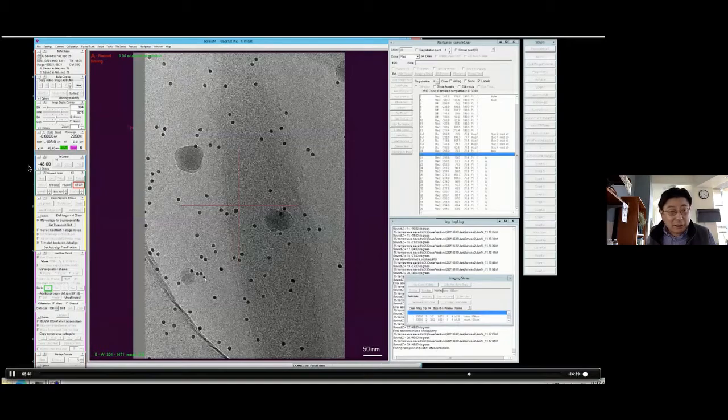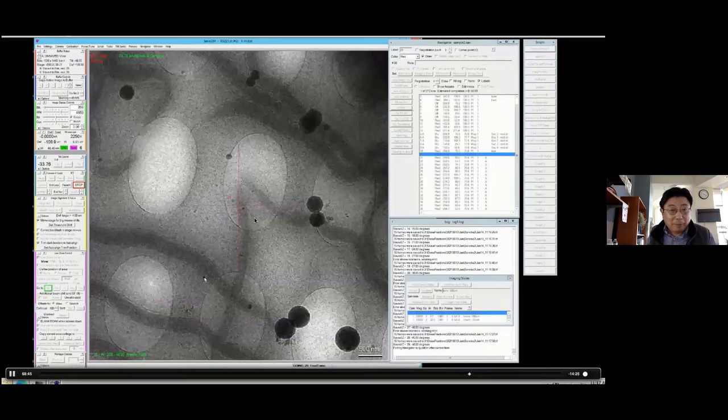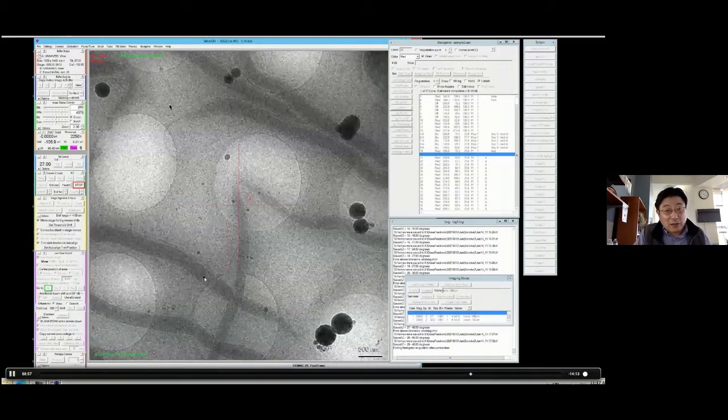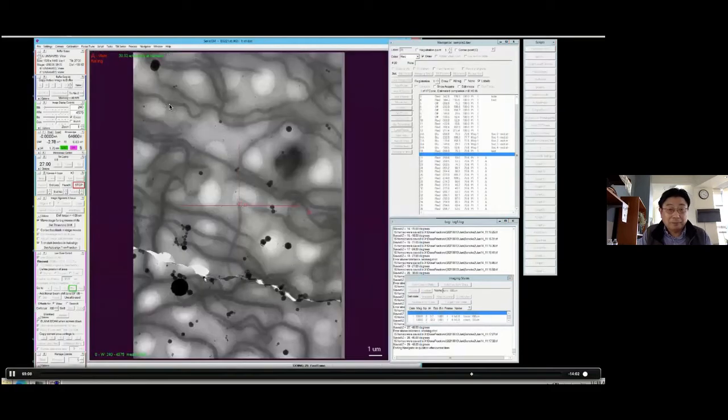In this case, it will finish this area and then stop, because I asked the program to stop. And then I can merge the new data I created with dummy back into this file. Then I can run overnight. So it's pretty effective.